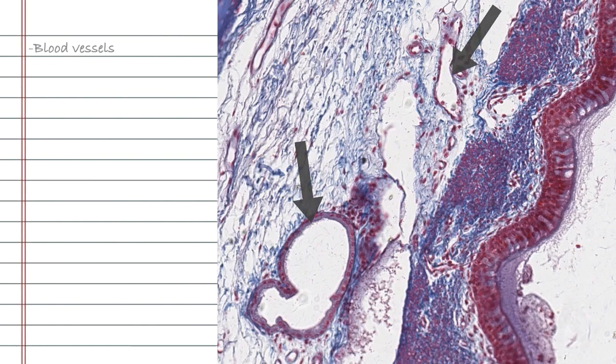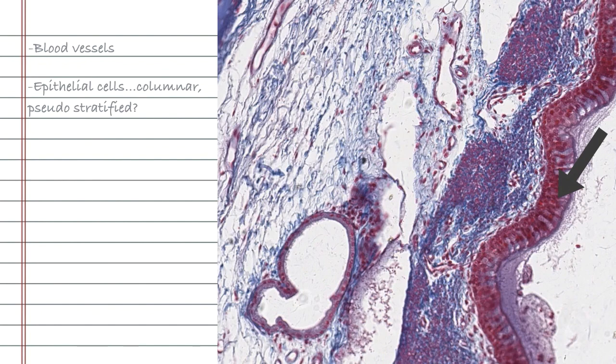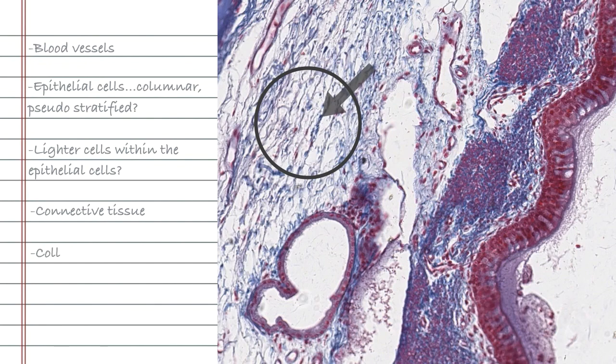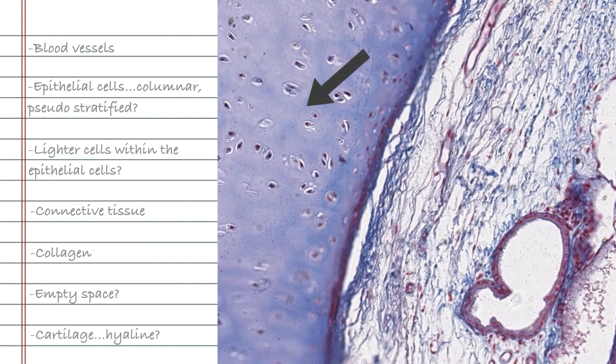We can see blood vessels here, epithelial cells that appear to be pseudostratified columnar cells, lighter cells within that layer, connective tissue in this area containing collagen fibres which is stained blue, some empty space where there is no tissue and hyaline cartilage if we move the slide.